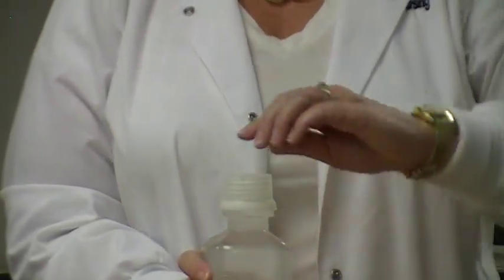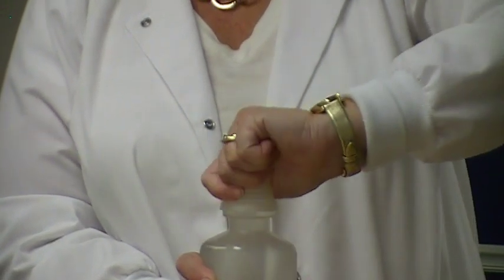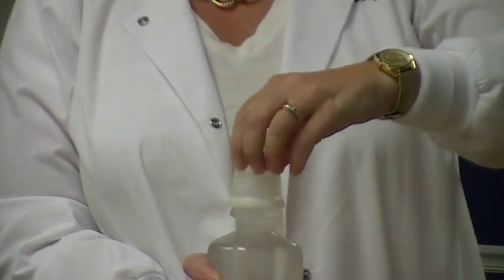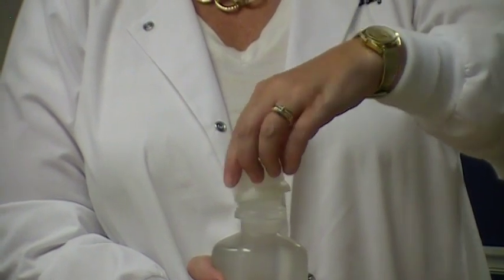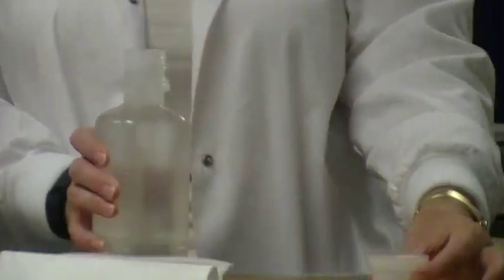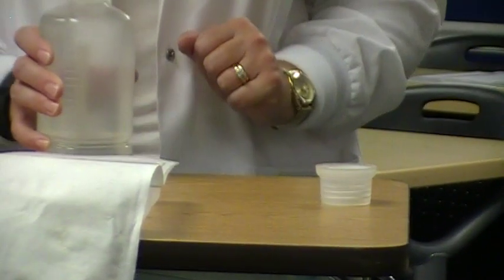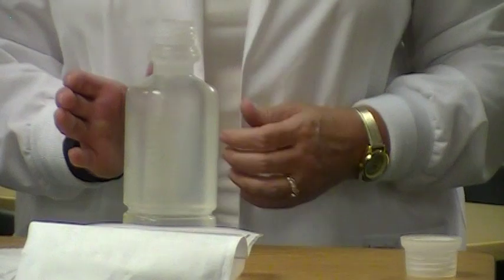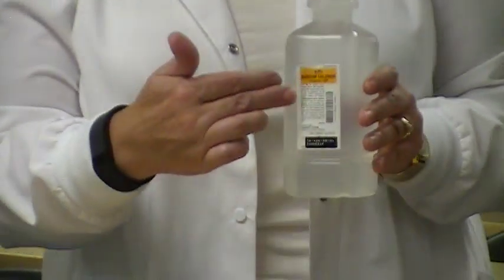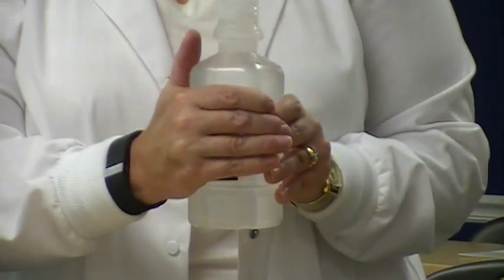The next thing that we're going to do is we're going to take off the cap. When you take it off, you want to put the cap on the table with the flat side against the table. Then we are going to grab the bottle, and when we grab it, the label needs to be in the palm of our hand.